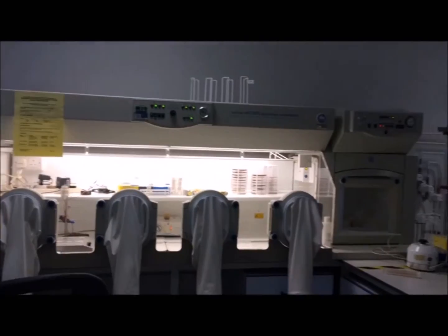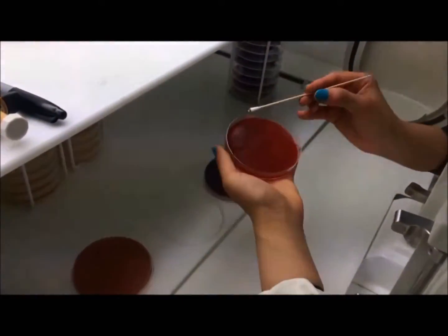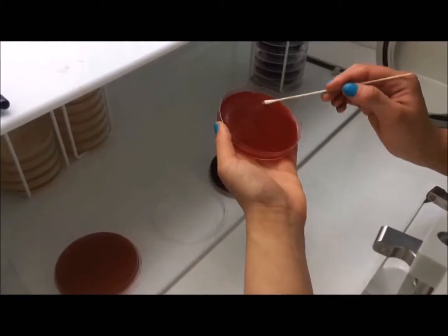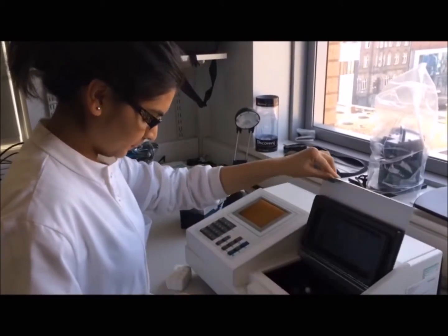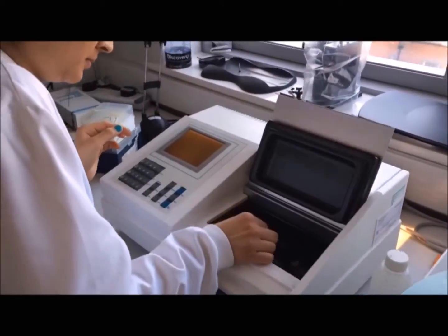So we first grew this bacteria on 5% defibrinated horse blood agar plates, and we left this agar plate to be incubated in this anaerobic chamber for 24 hours. And then once this Prevotella intermedia bacteria had grown, we created a bacteria suspension using PBS buffer, and we measured the optical density of this suspension at 650 nanometers using a spectrophotometer to obtain an optical density of 0.1.